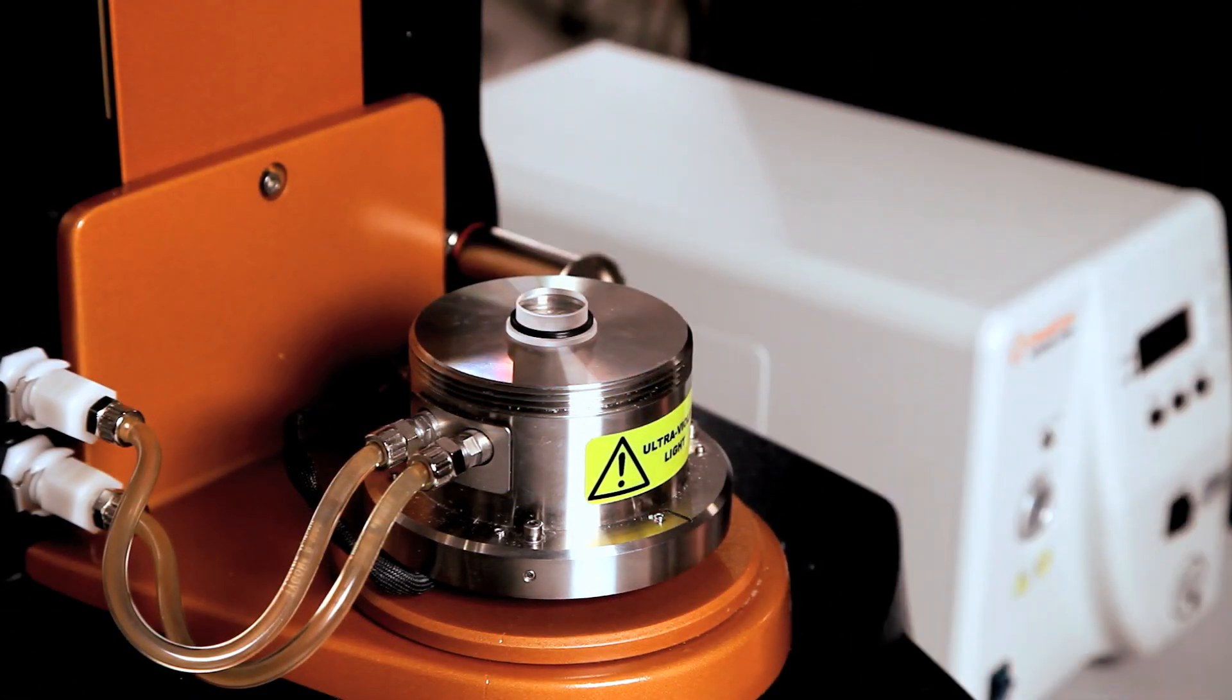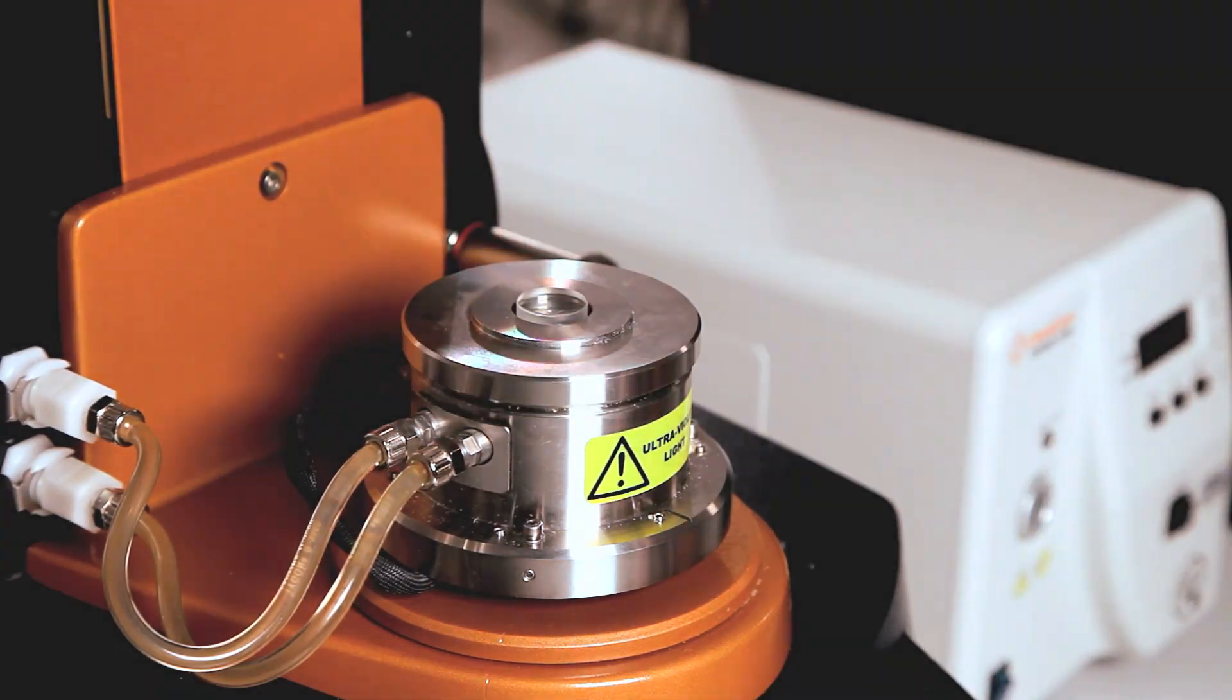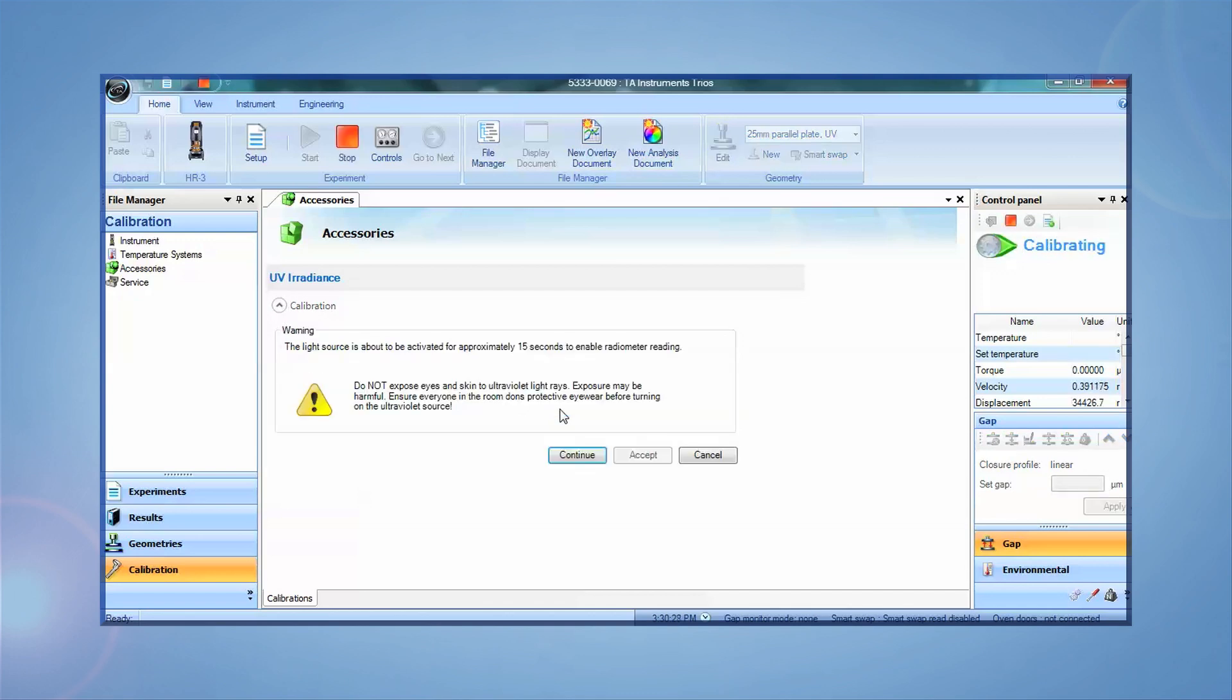After the LED source installation, it is necessary for an accurate measurement to calibrate the irradiance. Go to the TRIO software, Accessory Calibration, and follow the instructions.